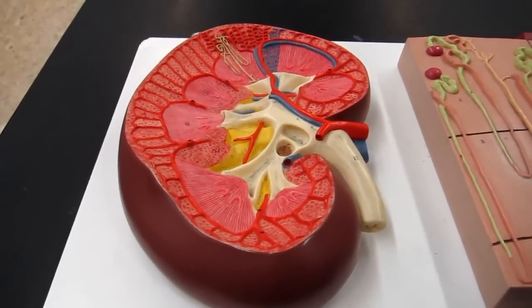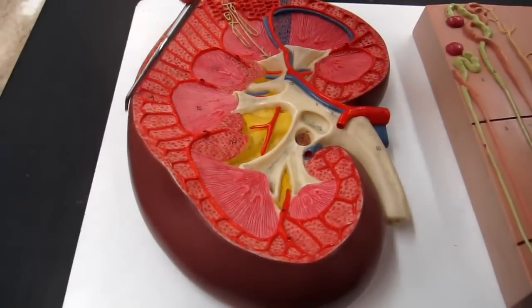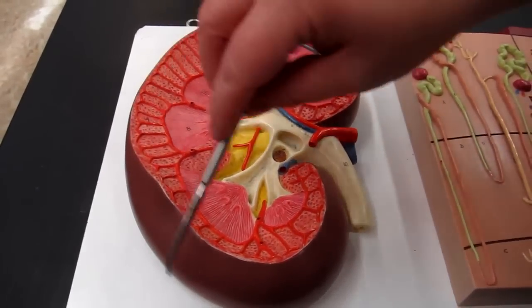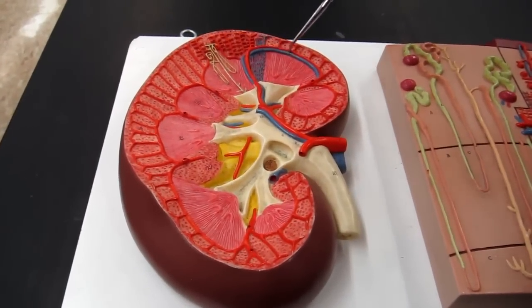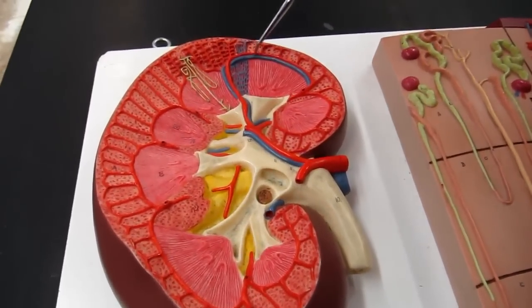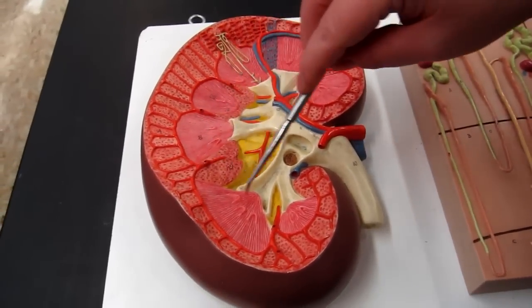All right, so we're picking up the kidney with a quick review of the gross anatomy. Again, we have the fibrous capsule, which is our external shell, with the cortex. Okay, and again, you can see the arcuate artery and vein here very nicely between the cortex and the medulla. Okay, so all of this would be the medulla.